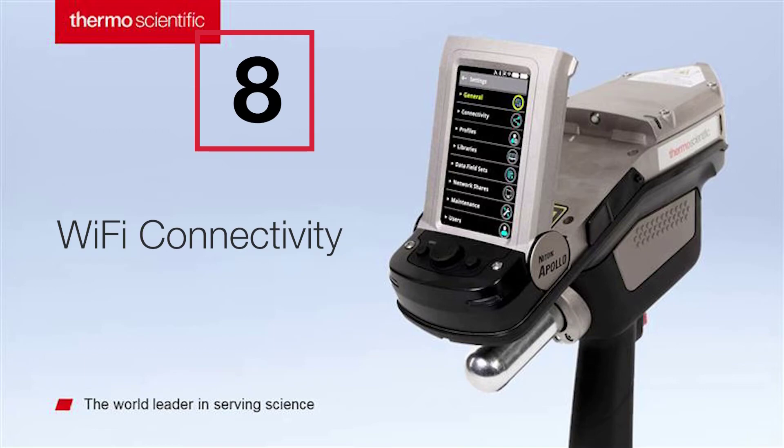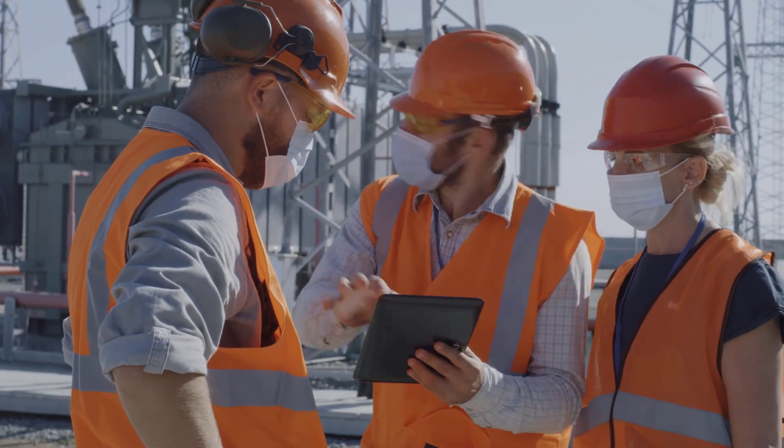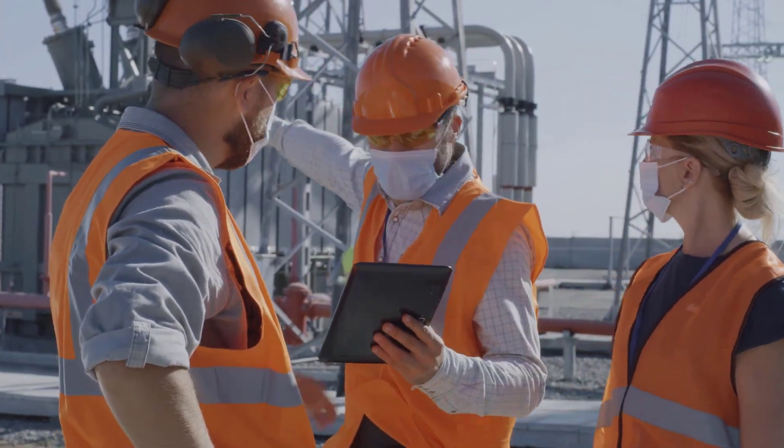The Niton Apollo keeps off-site team members in the loop on measurement data with Wi-Fi connectivity.